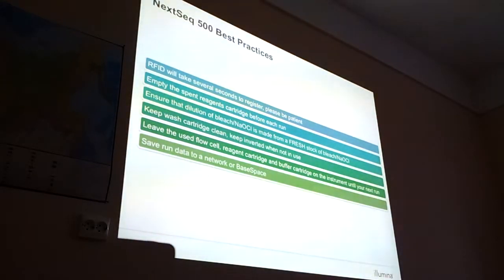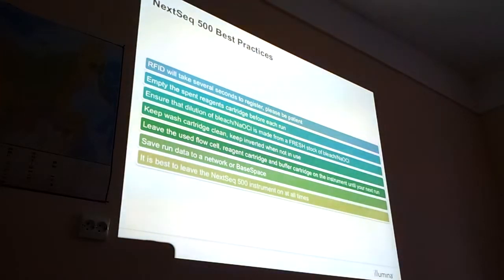Save the data not on the NextSeq computer, but choose a different computer on the network or BaseSpace. And officially we say you should leave it on.